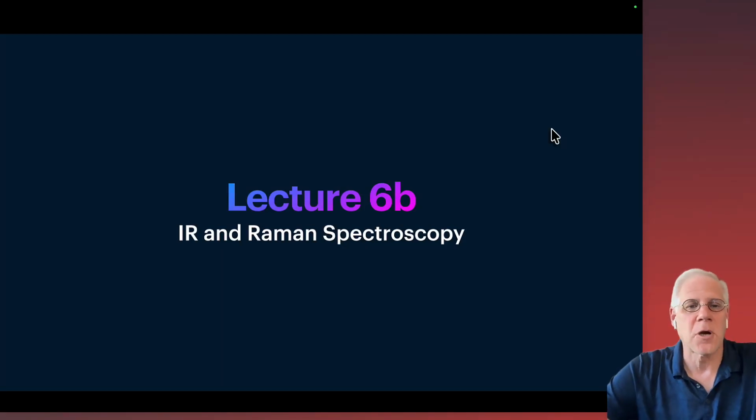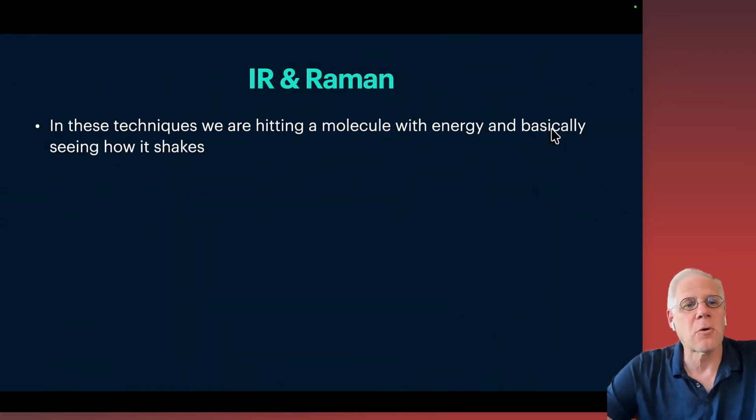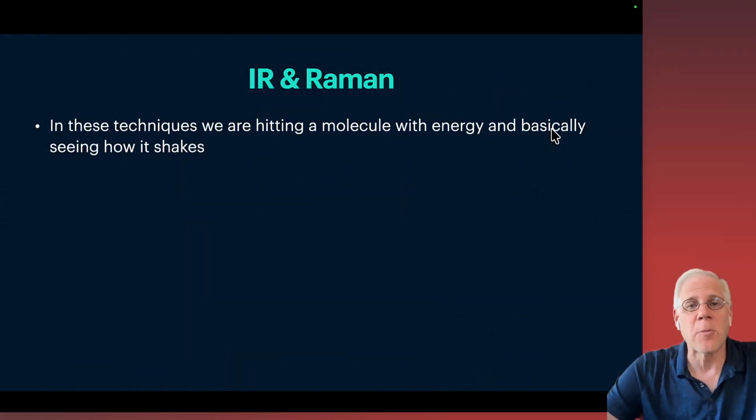So in this part of our lecture, we're going to be looking specifically at infrared and Raman spectroscopy. And this is probably what we go into the most detail on, and will take us a little bit longer than some of the other techniques. In both of these techniques, infrared and Raman, they're tied very closely.